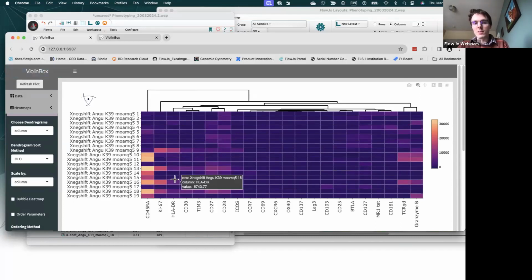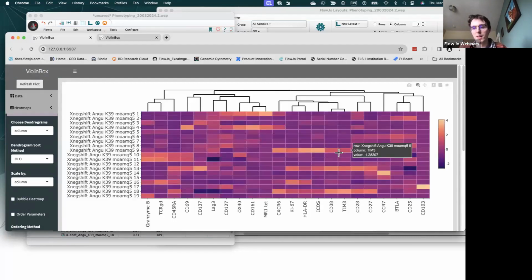And so we can see within each of the columns here what has high expression for these markers, what has low, what has middle, and just get a better idea of what the differences are between each of these clusters. So now, for instance, we still have our gamma delta T cells, which should separate pretty nicely. So the 16, 11, 10, those are definitely gamma delta T cell populations. And I think even maybe some of these other ones.